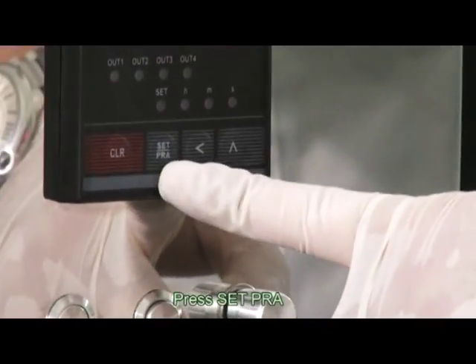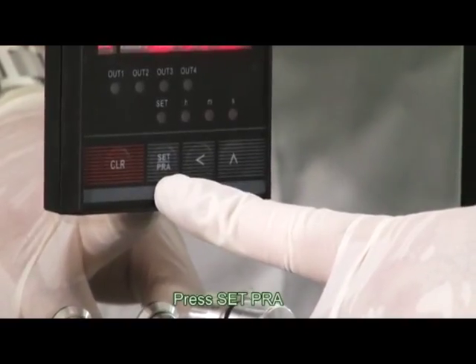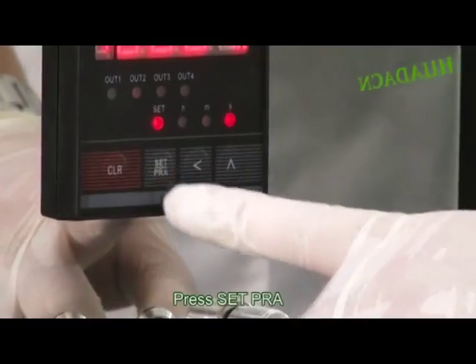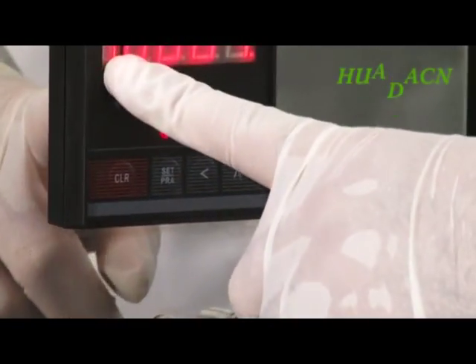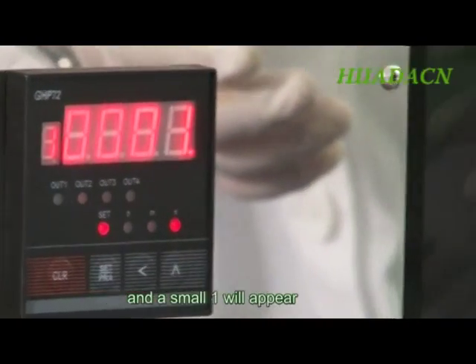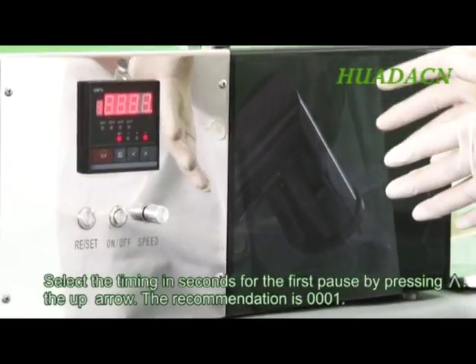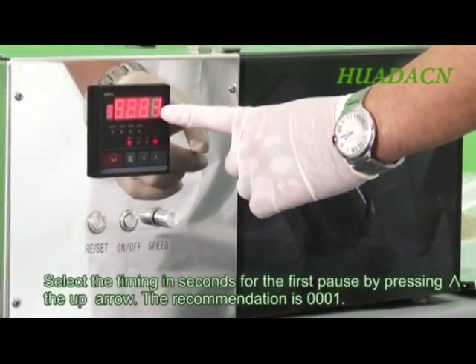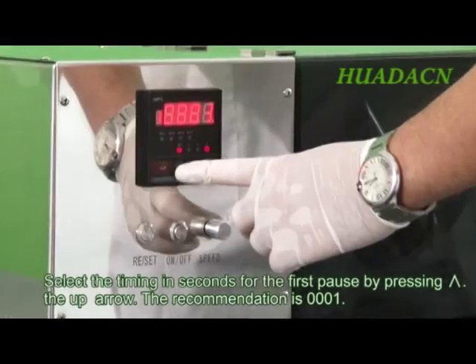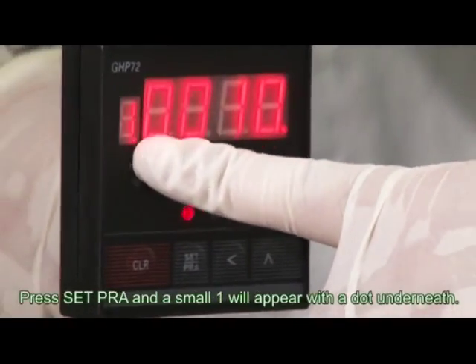Press SET PRA and a small one will appear. Select the timing in seconds for the first pause by pressing the up arrow. Press Set Pra and a small one will appear with a dot underneath.